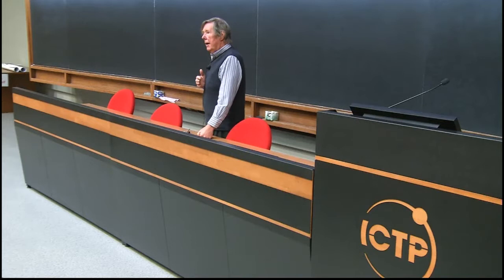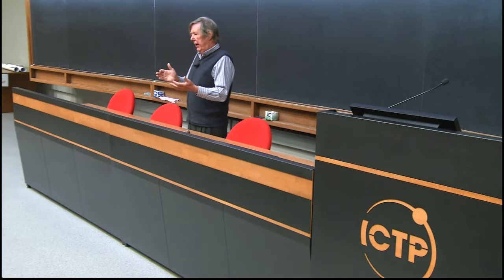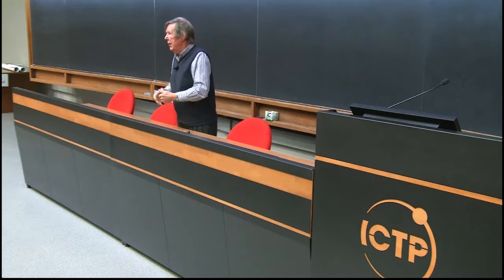I don't know if you know, there was a very nice paper by Demetri Psaltis from EPFL a couple of years ago now, where they built this system where they get the light from the sample. They look in the Fourier plane, and they make a hologram of it. So they've now got the phase information as well as the intensity information. Once they know the modulus and phase, they can refocus that light digitally and make a synthetic confocal. They did this in this paper. It's very neat, and it shows a lot of the similarity between ptychography and some of these other techniques, I think.